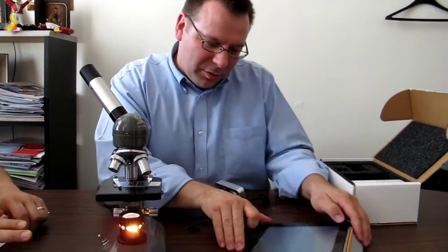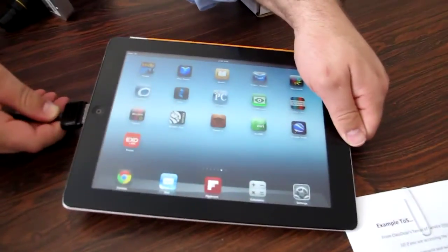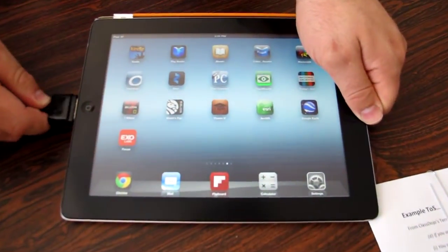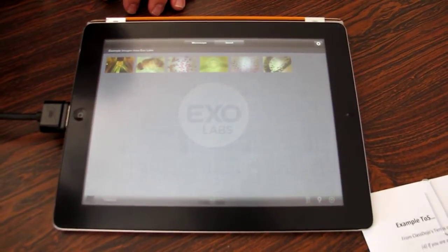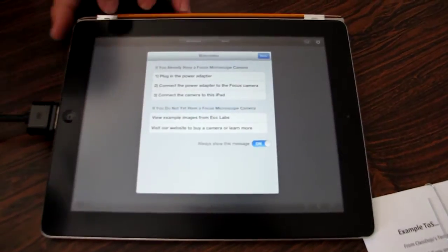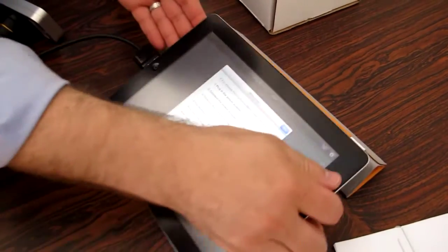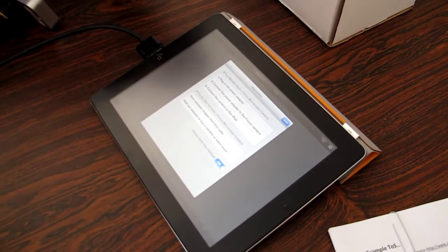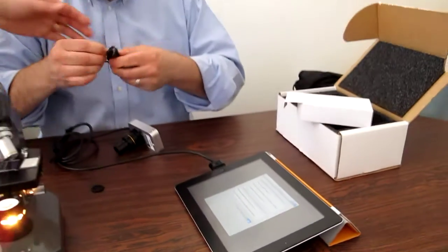I did install already the Exo Focus camera app, all right. So we're gonna plug this in and see what happens. Okay, and we'll open up the app. Okay, so microscope, okay. Plug in the power adapter. Full power adapter. You got to do one more. That must be this other piece here.